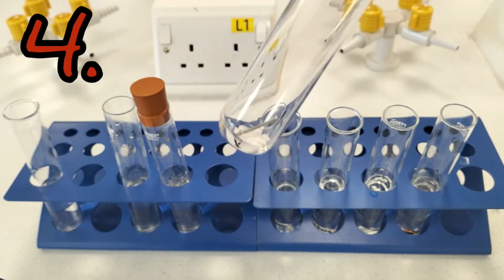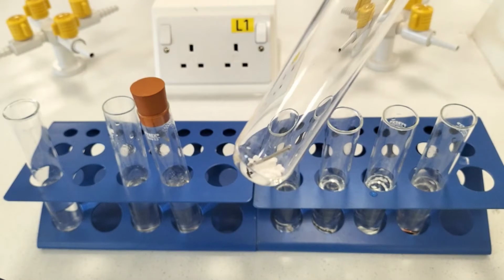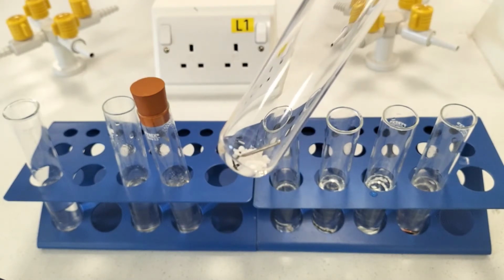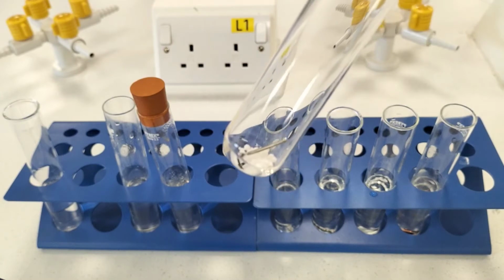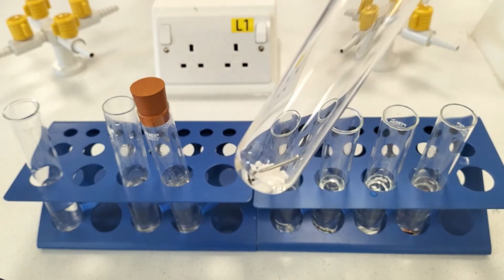And actually, this white solid at the base of this open boiling tube is known as anhydrous calcium chloride. It's a white solid and it's actively absorbing moisture from the air. It's a drying agent. So this is a very dry environment around this iron nail.